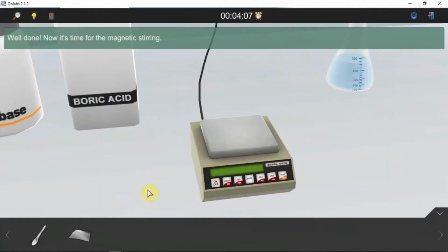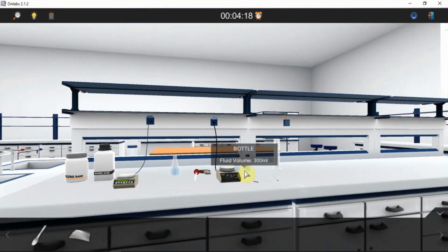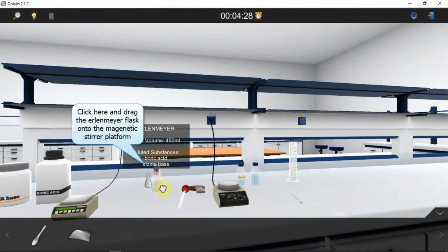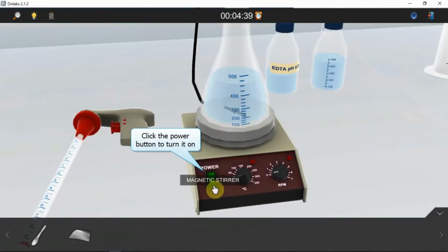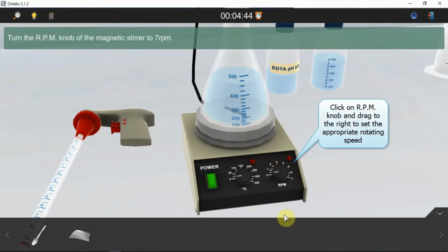Well done. Now it's time for the magnetic stirring. Put the magnetic stir bar in the Erlenmeyer flask. Well done. Now place the Erlenmeyer flask on the magnetic stirrer. Well done. We are now ready to stir the solution. Turn on the magnetic stirrer. Well done. Turn the RPM knob of the magnetic stirrer to 7 RPM.